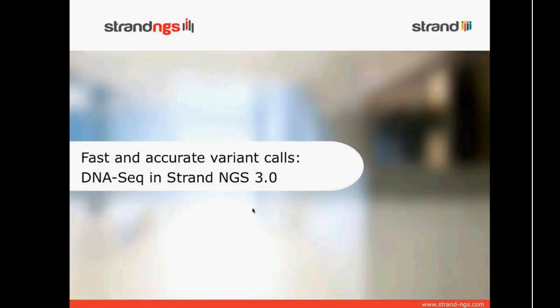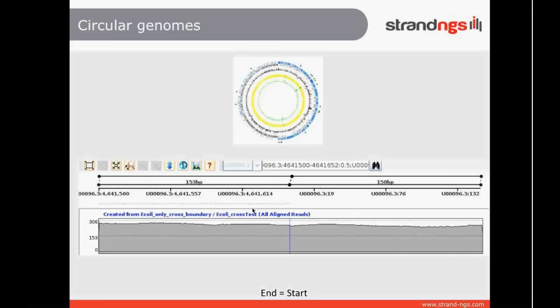So that's as far as new features go. I recommend that if you're interested in our new features, you should definitely read the release notes. You should definitely read the relevant parts of the reference manual if you're interested, and obviously get back to us for questions if you have any.